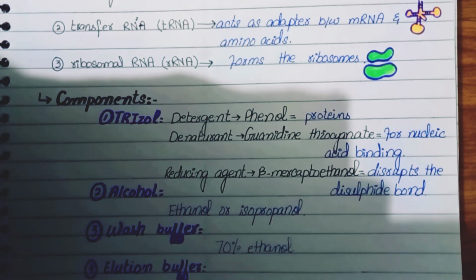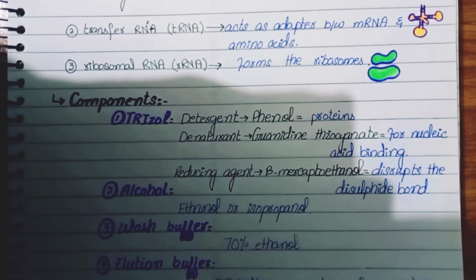Before going to the procedure, I would like to mention that in the previous lecture we discussed that for any extraction, or nucleic acid extraction, we have 4 major steps. What are these major steps? The first step is cell lysis, and for cell lysis we use the lysis buffer. Second step we have precipitation.